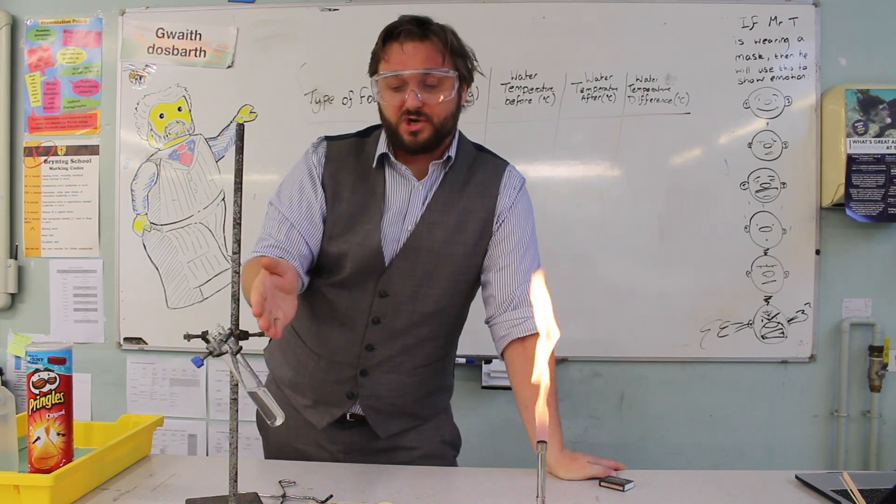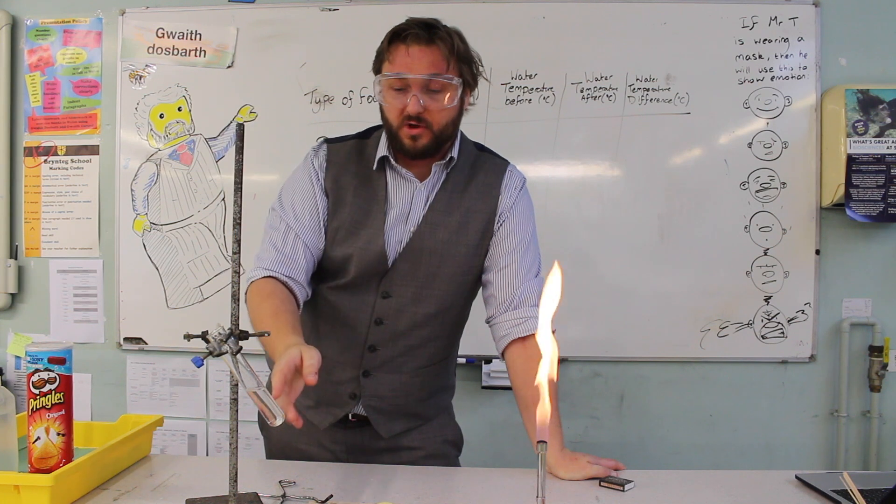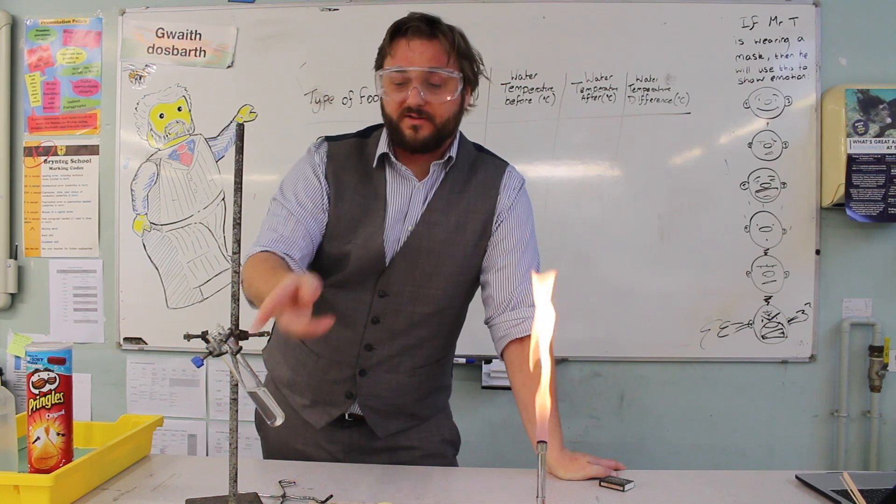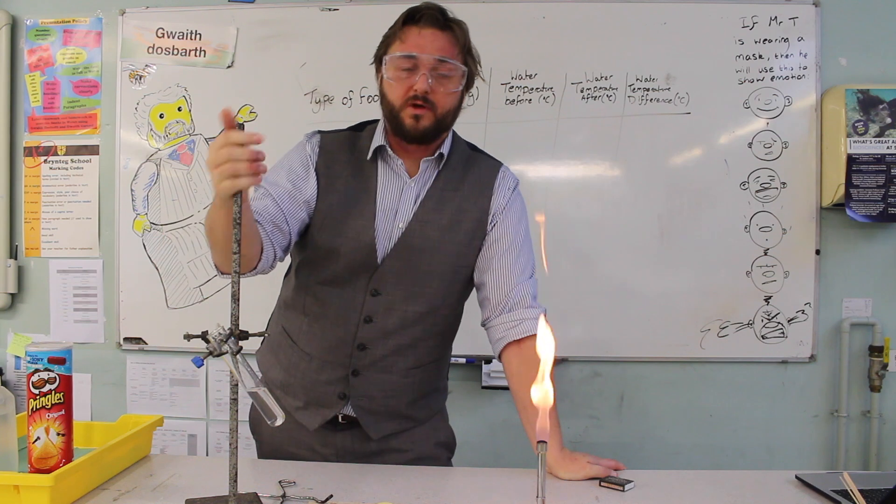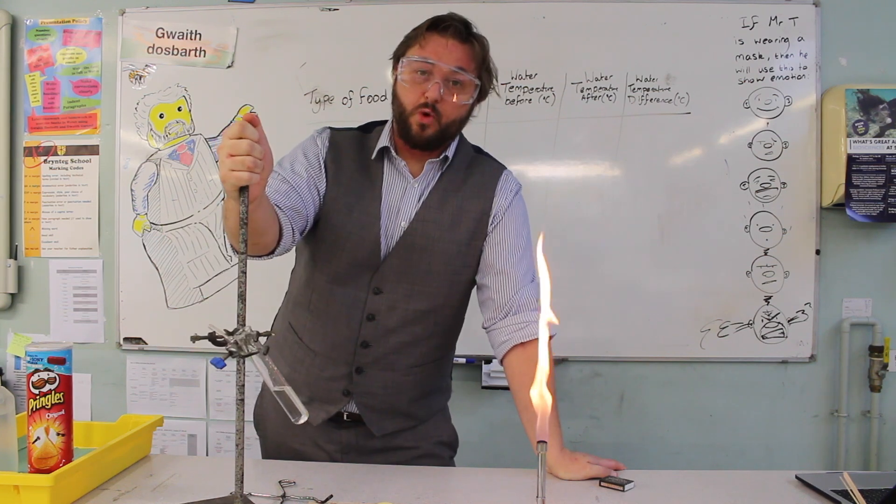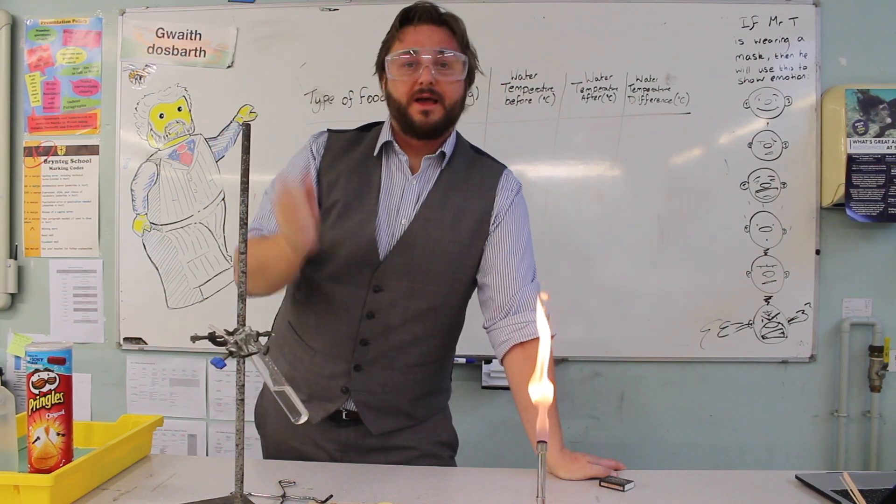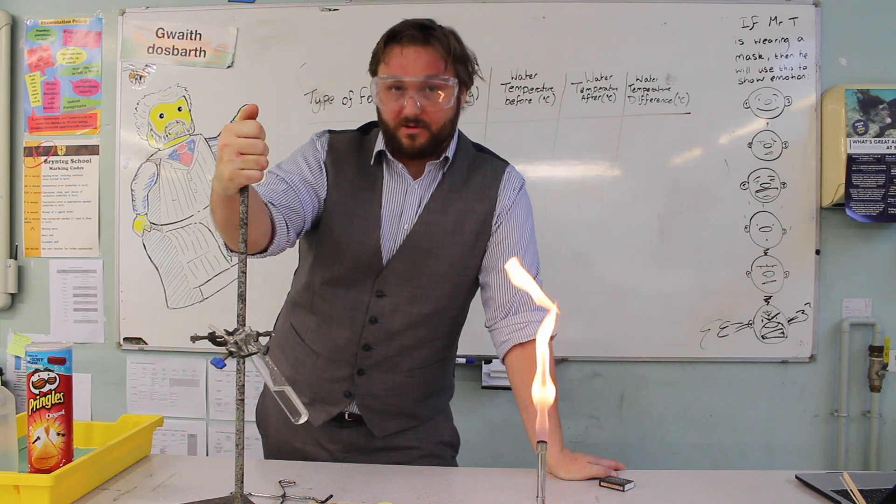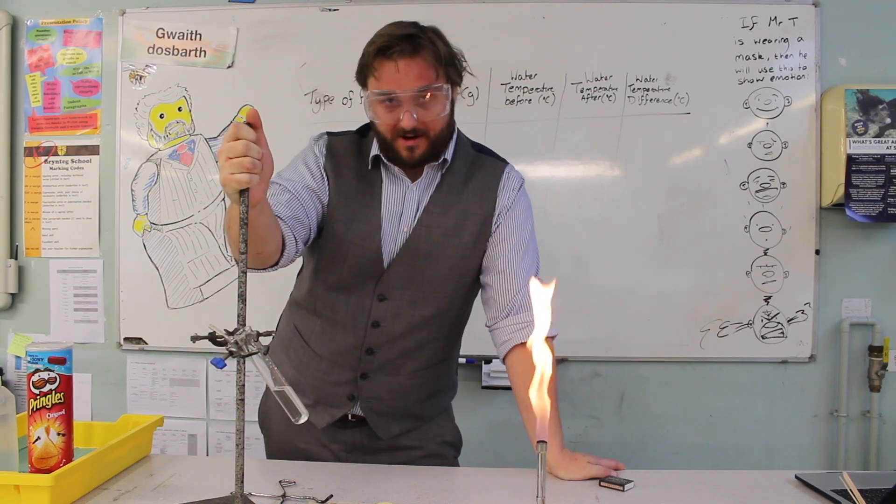It's important as well to have your boiling tube slightly at an angle just because you don't want the heat from the flame rising up and directly interfering with your clamp stand. You also want this pointing away from you because worst case scenario it boils, bubbles up and spits out. We want to do that away from ourselves.